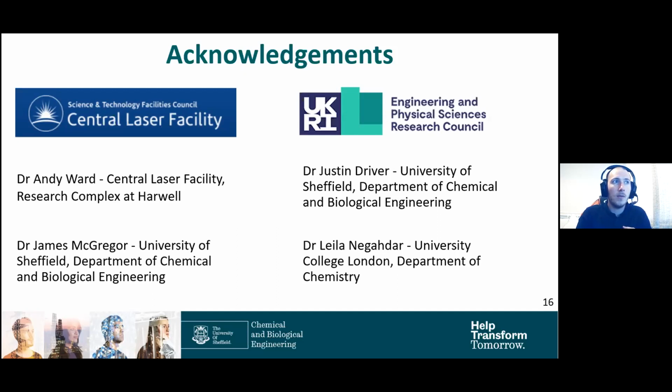So it's really useful in studying the synthesis of catalysts that use flow tubes, or even reactions that occur in flow tubes, just to replicate the conditions. Okay, that sounds really interesting.